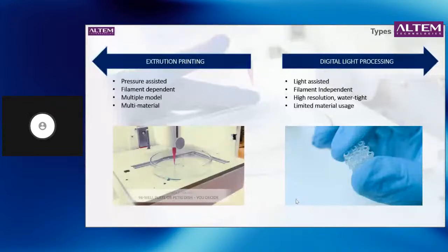Here in extrusion based printing, you have the option whether you want temperature to be the cross linking agent, or you want light to be the cross linking agent, or any other physical factors to contribute towards the cross linking. But when it comes to DLP based printing, it is purely light based printing. It's light assisted. So here the cross linking is happening with light. So you need to set protocols and create materials that follow the process of photopolymerization. So having photopolymerization involved will eventually lead to creating the type of material you want for a DLP based process of bioprinting.